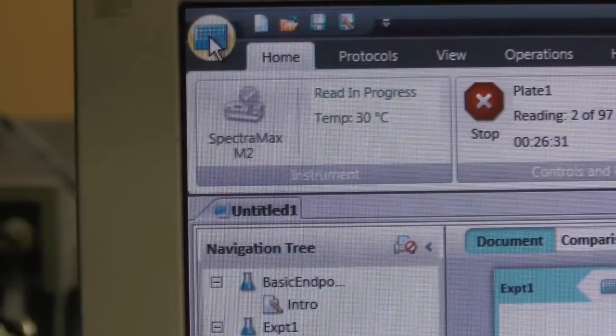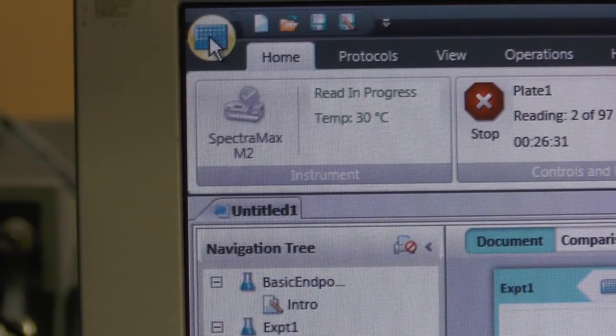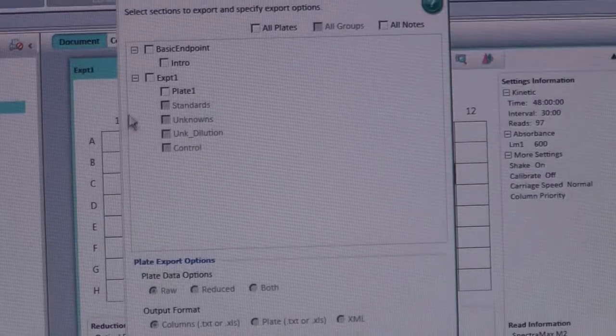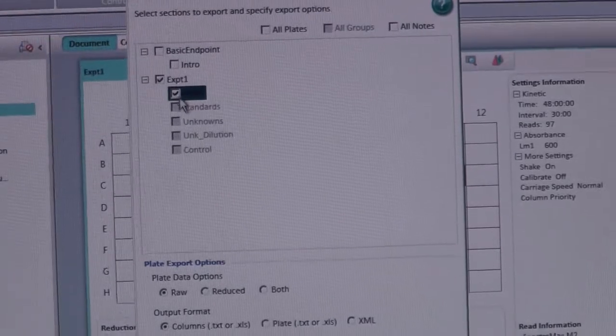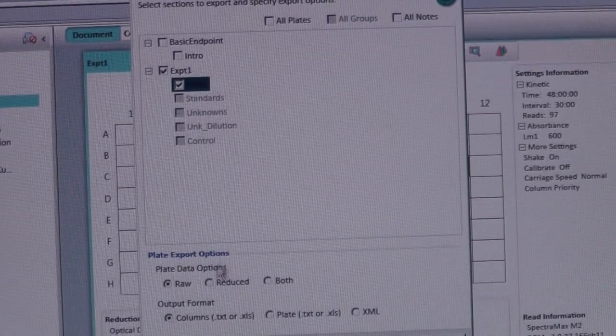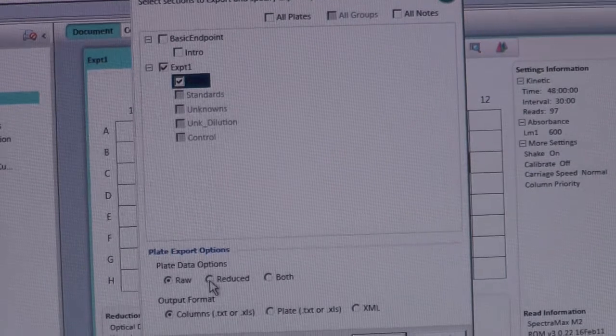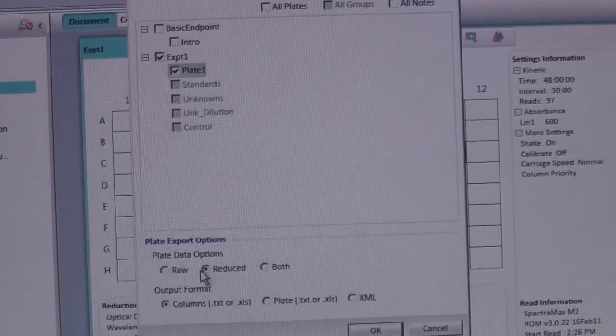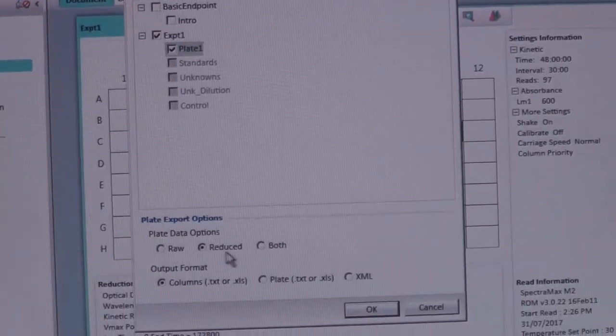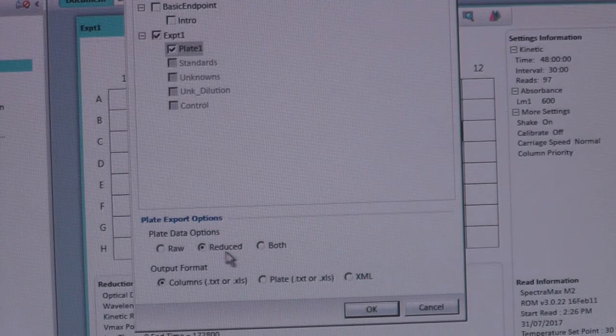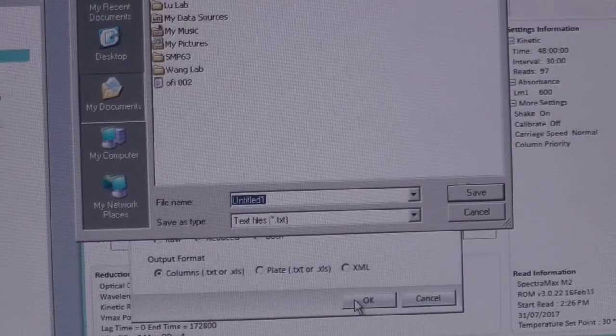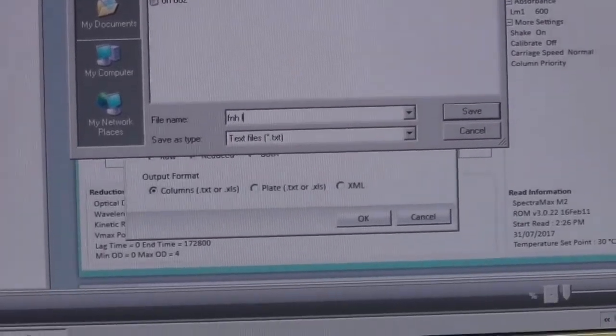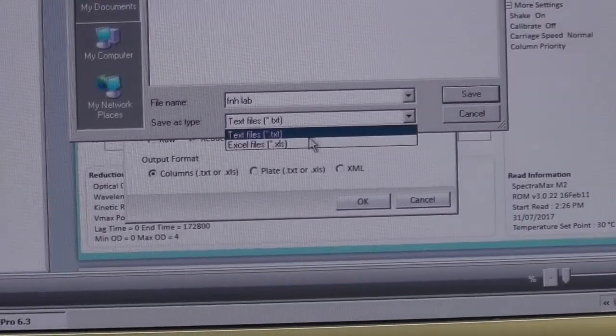When the readings are complete, click on the plate icon at the top left corner to export your data. Check the box for Plate 1. You can select Raw to export the unedited version of your data, or you can select Reduced to export your data with the blanks already subtracted. Make sure to select Columns Output Format for Kinetic Runs and click OK when finished. Be sure to change your file type to Excel files before clicking Save.